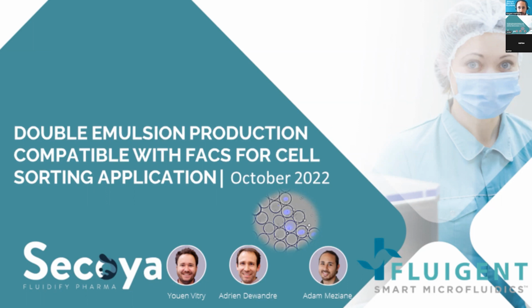In the meantime, what I can say is that here we are making a workshop session. It's not, let's say, a standard webinar. The idea of this session is to have good interactivity together, to be as close as possible to a physical workshop. So you will see that we are going to present some slides, but there will also be a dedicated demonstration session, so we can show you how we can use our technologies to perform double emulsion, and so you will be able to understand a bit more about the technology as well.